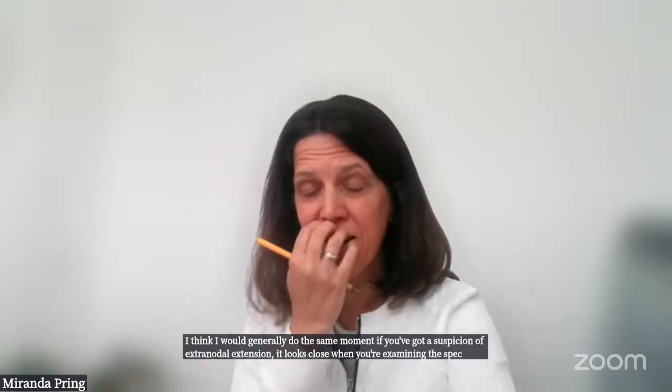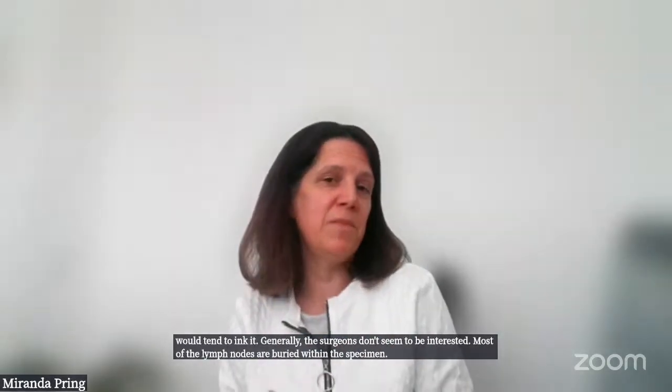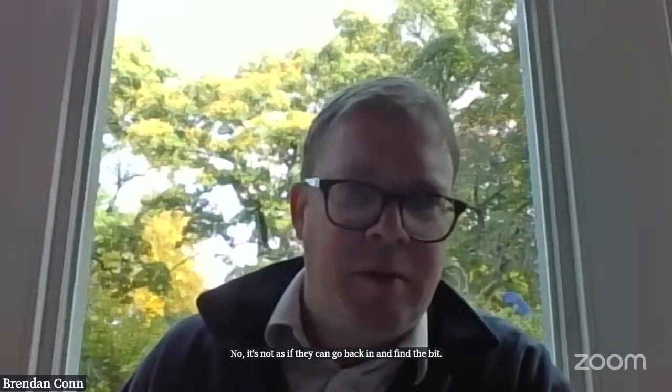I think I would generally do the same. If you've got a suspicion of extranodal extension, it looks close when you're examining the specimen, I would tend to ink it. Generally the surgeons don't seem to be interested. Most of the lymph nodes are buried within the specimen. So I think it's on an independent basis which specimen you're looking at. But generally, I don't see the need. It's not as if they can go back in and find the bit retrospectively.